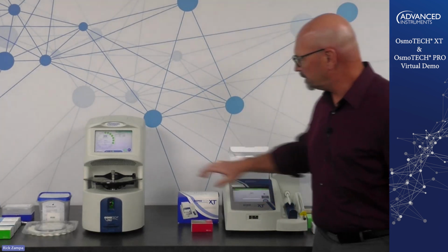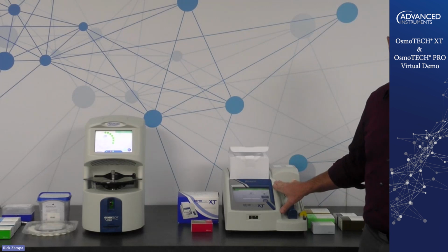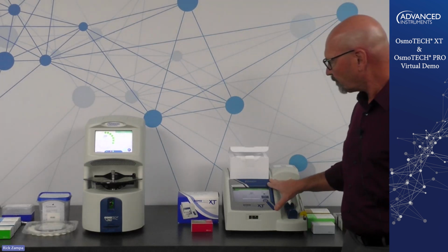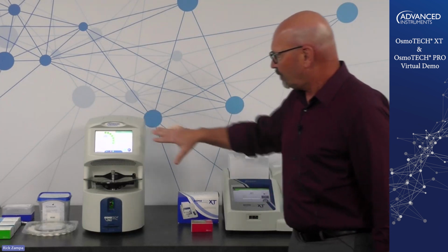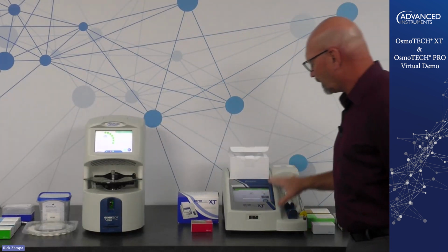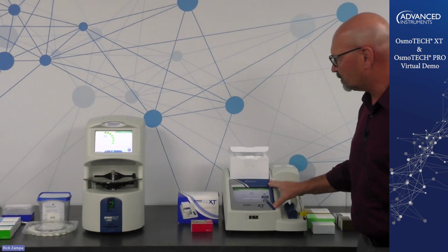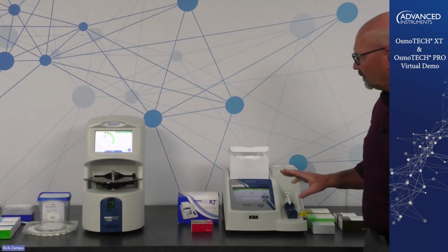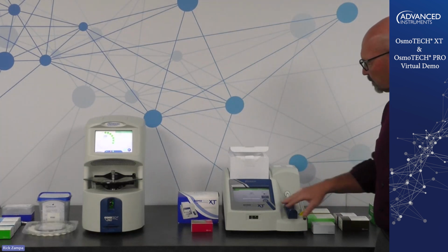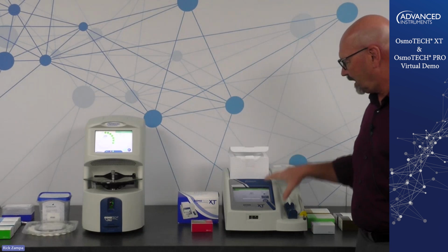So we have the two instruments up here on the bench. As Shweta said, we're going to be talking about the OsmoTECH XT, which is the single sample instrument, and the OsmoTECH PRO, which is the multi-sample instrument. I have both the instruments set here on the bench. I'm going to start out with the OsmoTECH XT, the single sample instrument, for this particular demonstration. Then we'll move to the OsmoTECH PRO and show you some of the differences and the different operation parameters between the two. So starting with the OsmoTECH XT, you can see we have the instrument here.